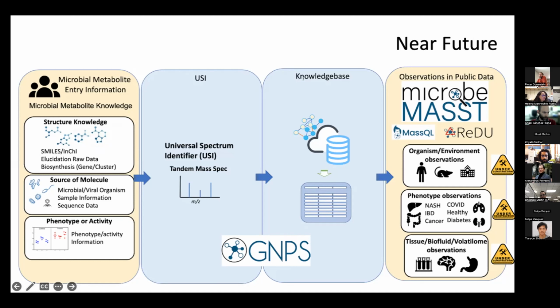Oliver Barr is interested in contributing siderophores. That would be great. There are a couple of studies ongoing in that as well, but certainly it will be wonderful to add. You can search it with and without the metal additions. I don't think many of the siderophores that we know exist have been annotated already in the knowledge base, so this would be a great contribution.